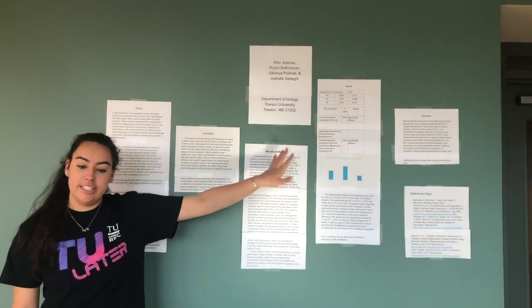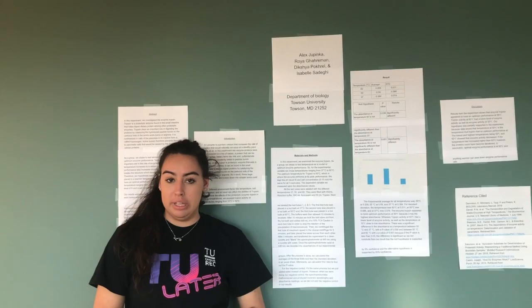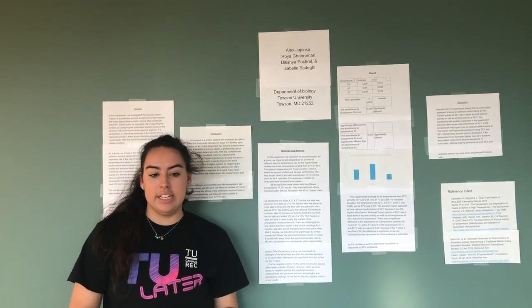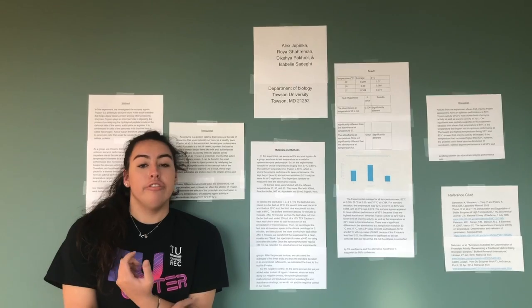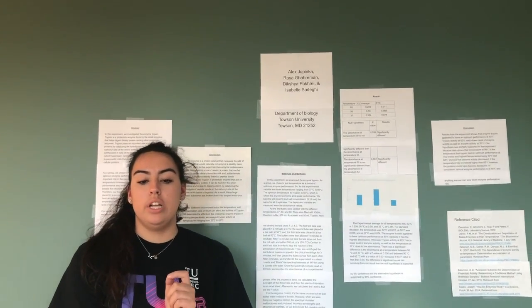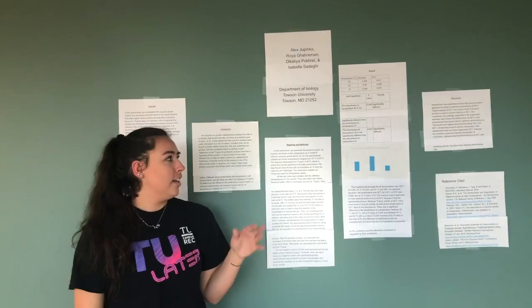So based off of our activities, we can infer that the average of the 62 degrees Celsius was 0.209, and the variability was 0.011. For the 50 degrees Celsius, the average was 0.59, and variability was 0.088. For the 37 degrees, our average was 0.384, and our variability was 0.074.